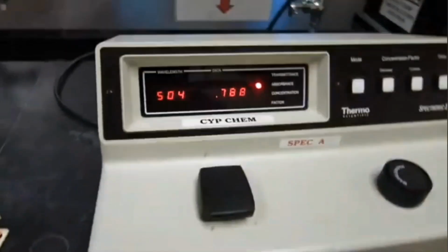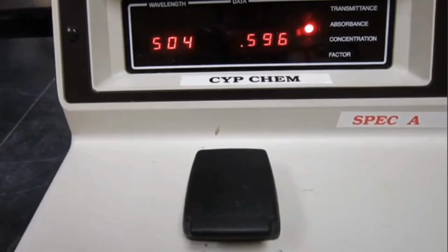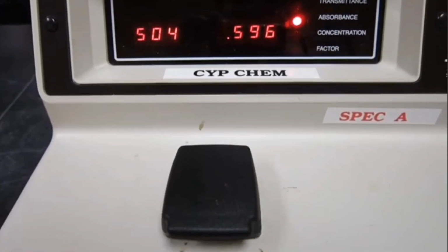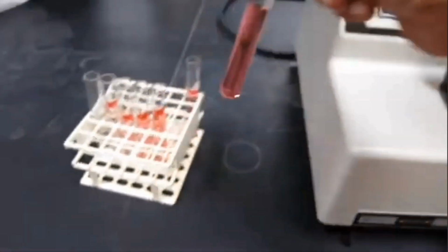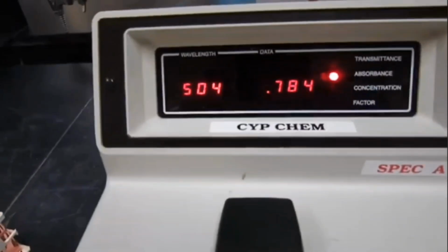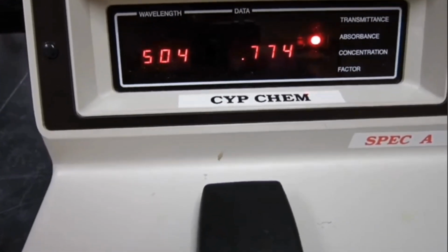So right now what you are seeing is getting the absorbance data for each solution that we made. Since each solution's concentration increases, we see that the absorbance increases. That's the last one, 0.774.